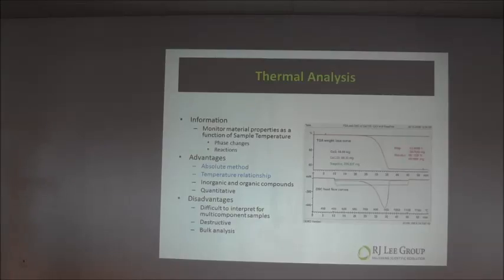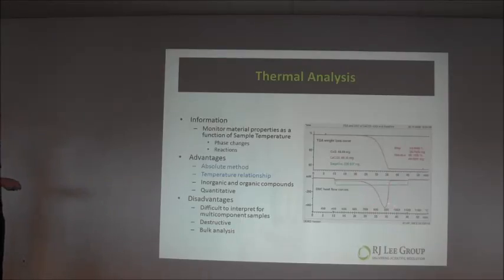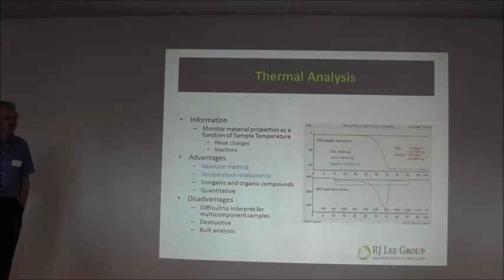Okay? Some reactions don't have a weight loss, but they may have a heat gain or heat loss. It might be endothermic or exothermic. We can look at that, monitor the heat that the sample's given off as we change the temperature, and again relate that back to the type of change, the type of reaction that's going on, and the amount of heat that's given off allows it to be, again, quantifiable.